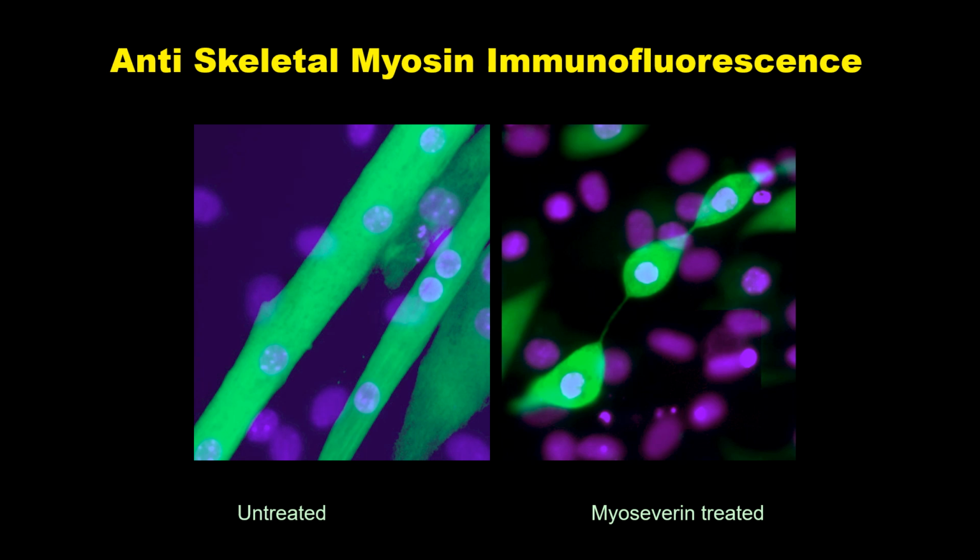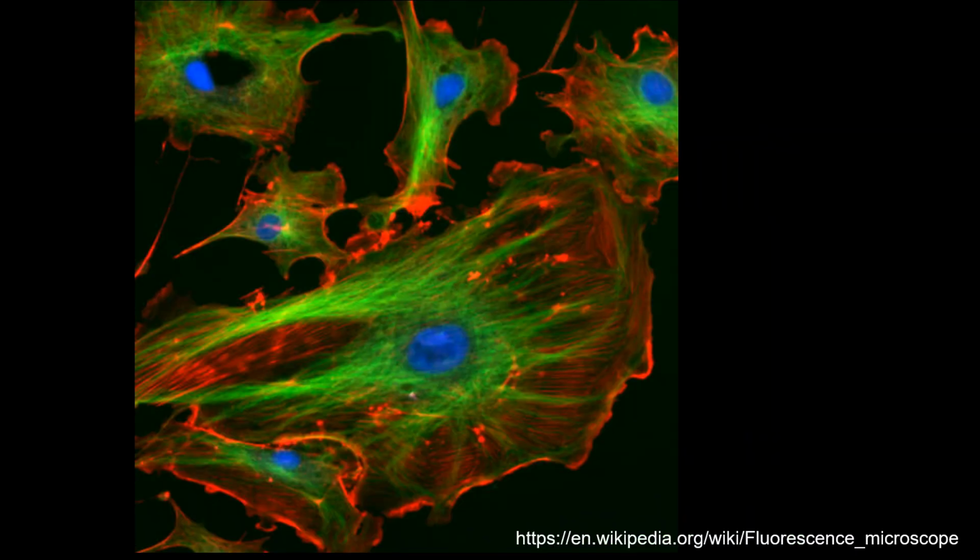They look quite lively, but these cells are fixed and dead cells. Our eyes can see multiple colors. So in this case, the green color shows microtubule structure, red color shows actin structure, and blue color represents the nuclear structures.